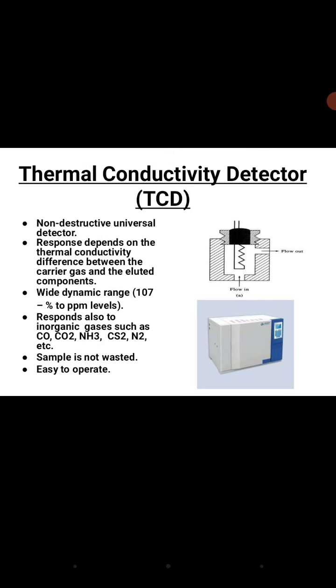Thermal conductivity detector, that is TCD, a non-destructive universal detector. Response depends on the thermal conductivity difference between the carrier gas and the eluted components. Wide dynamic range. Responds also to inorganic gases such as CO, CO2, NH3, CS2, N2, etc. Sample is not wasted and it is easy to operate.